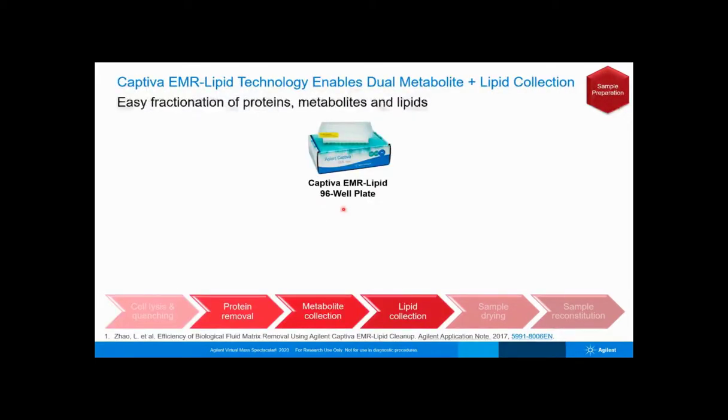After cell lysis and quenching, the cell lysate is next separated into metabolite and lipid fractions. Separation of these fractions improves the LC-MS analysis of the samples by making it possible to target the separation of unique compound classes during liquid chromatography. This gives improved separations and increases the number of compound identifications. Furthermore, removal of lipids from the polar metabolite analysis helps increase column lifetime.